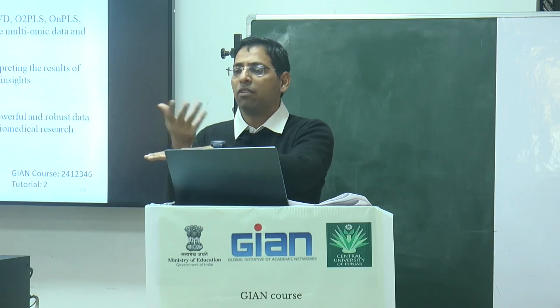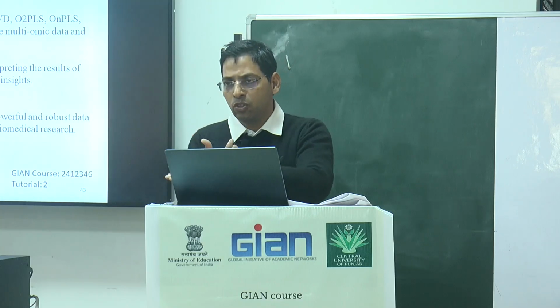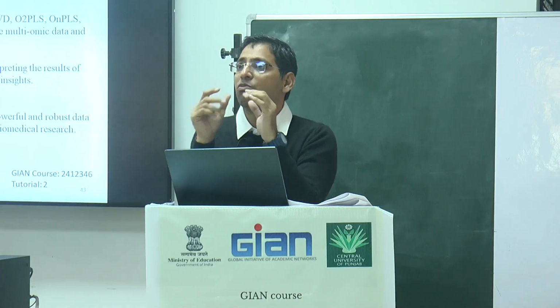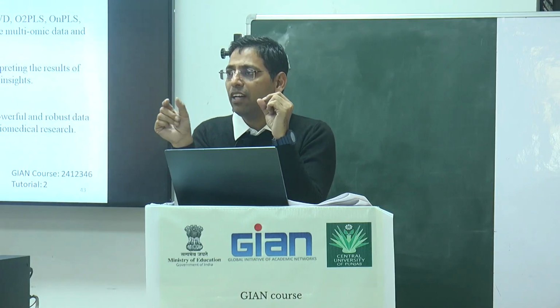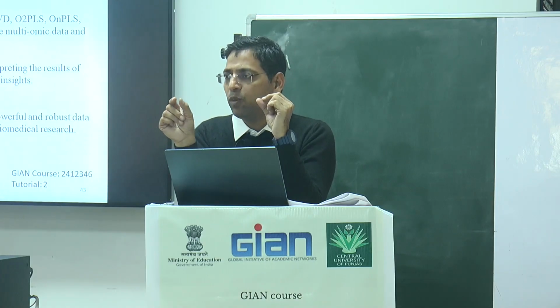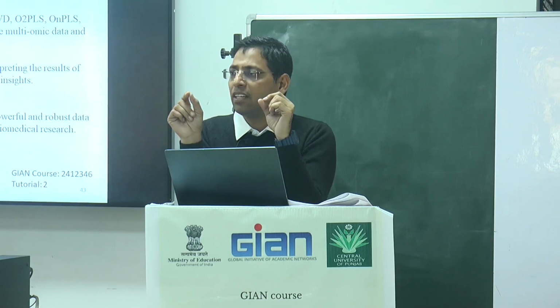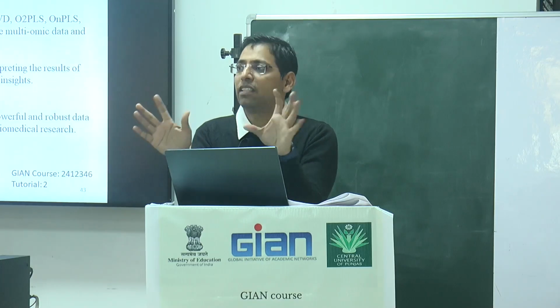So next time you don't know the reason why it is coming at 26 minutes. So you have to optimize the condition. You change it. If it is coming at 25, manipulate those parameters. It will come automatically at 28 in the constant predefined condition, definitely.